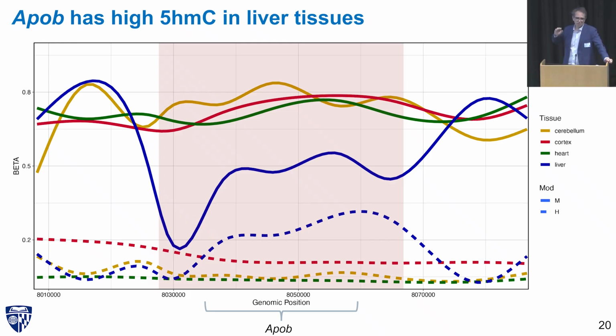We also think that you're going to be able to say the same kinds of things by looking at non-CG methylation for similar reasons. We want to look at tissue because it will give us a more realistic appreciation of how epigenetic regulation might be happening, even though it's also very complex because of the heterogeneity of tissue.